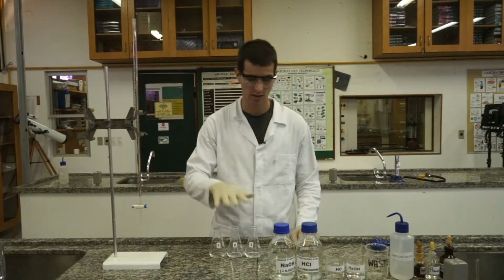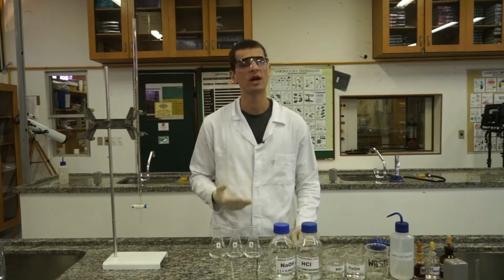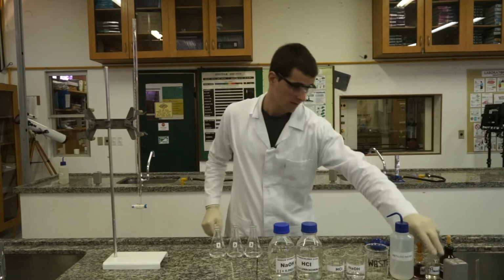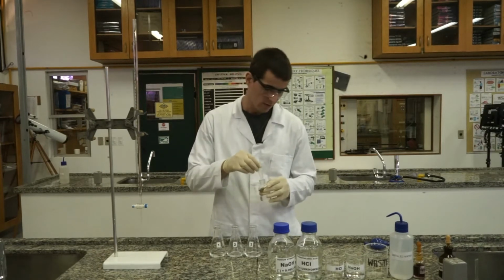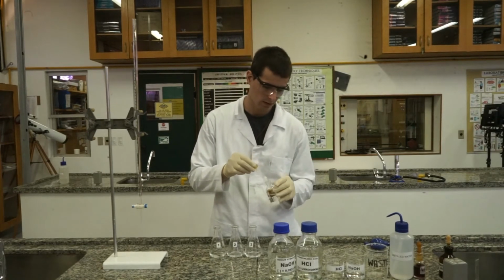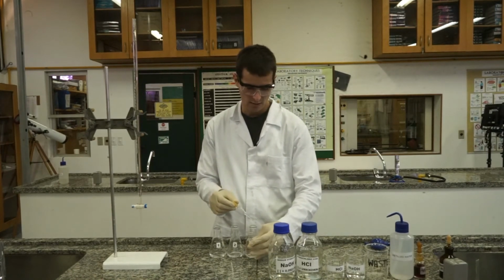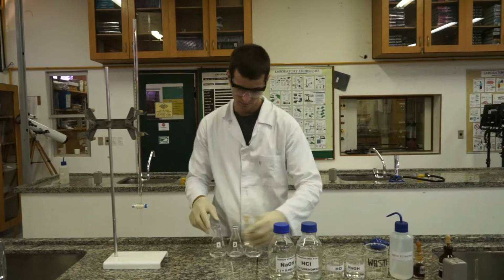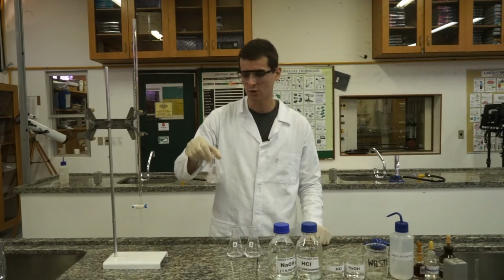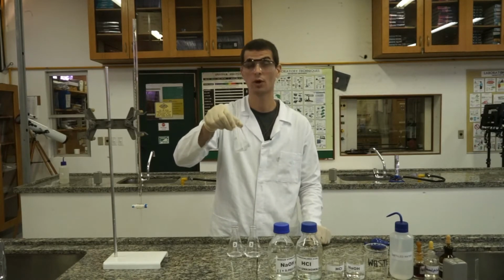Now, since we are using 2 clear solutions, the TITRANT and the ANALYTE, we need to have something that will tell us when we have reached the end point. And this thing will be the indicator. Let's start with phenolphthalein. I'm adding 3 drops to each Erlenmeyer flask. In acid solution, phenolphthalein is clear, but in basic solution, phenolphthalein is going to turn pink.